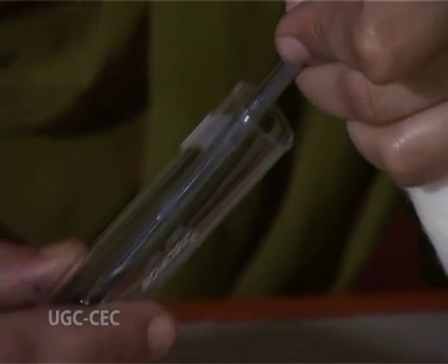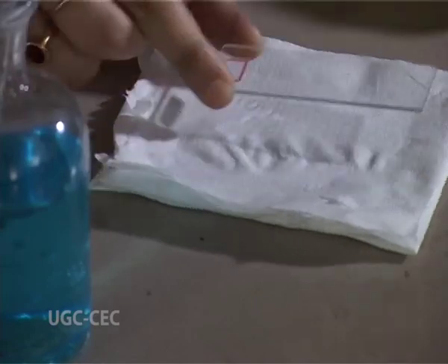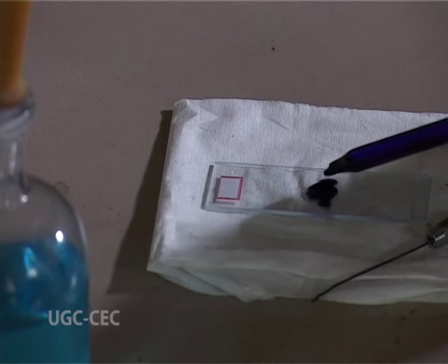We take a clean grease-free slide, a loopful of Klebsiella pneumoniae culture is taken, a smear is made, the smear is allowed to air dry, and then we flood it with crystal violet and keep it for 2 minutes. Ma'am, why is the smear not heat fixed in this case? Because during heat fixation, some of the bacterial cells might shrink, and if they shrink, then morphology will be altered and we won't be able to see the capsules carefully. So during capsule staining, the heat fixation step is omitted.